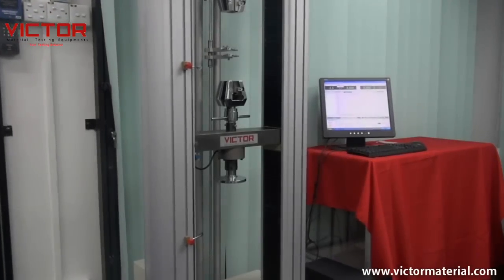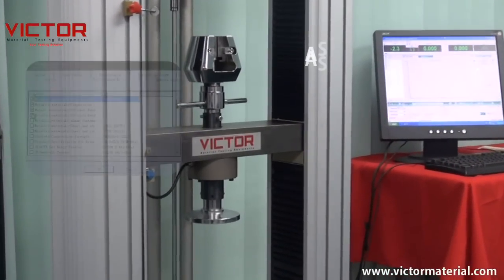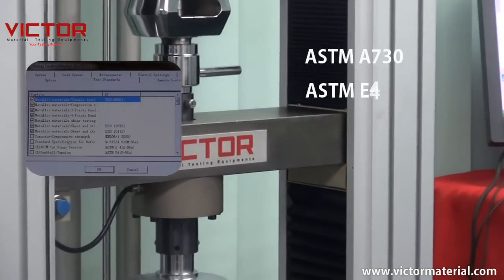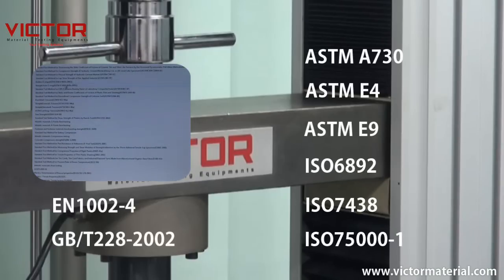The Victor testing machines are manufactured, comply, and apply to international standards ASTM-A730, ASTM-E4, ASTM-E9, ISO-6892, and more.